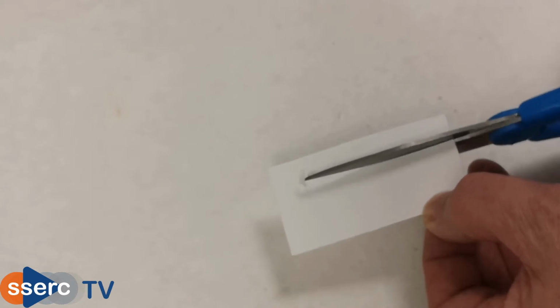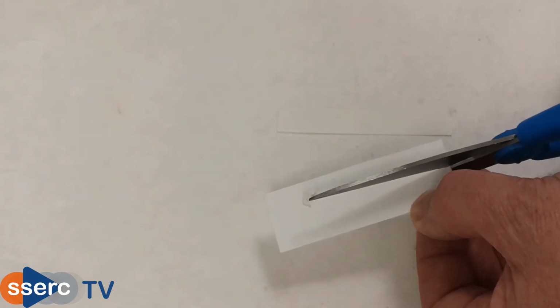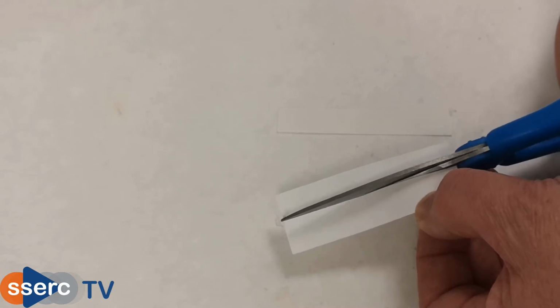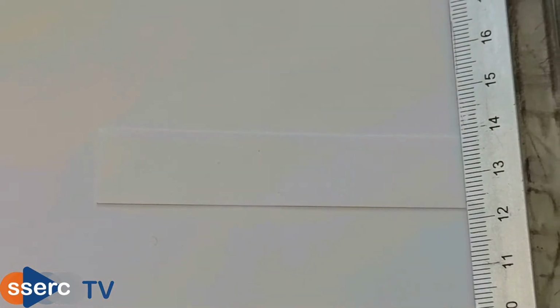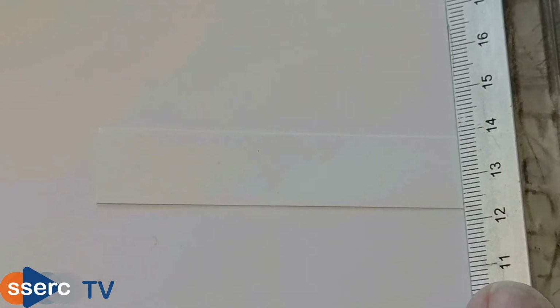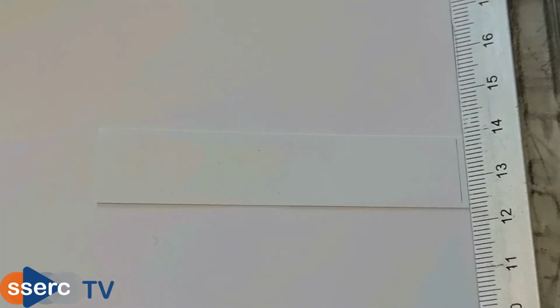Next, we prepare the TLC plate. These are quite expensive, so we're going to cut it so we only use a section. You may also need to make sure it is cut to the right length, though in our case it's fine. Once we have our pieces, we're going to take one and draw a pencil line about 1 centimetre from the bottom. This is the start point.